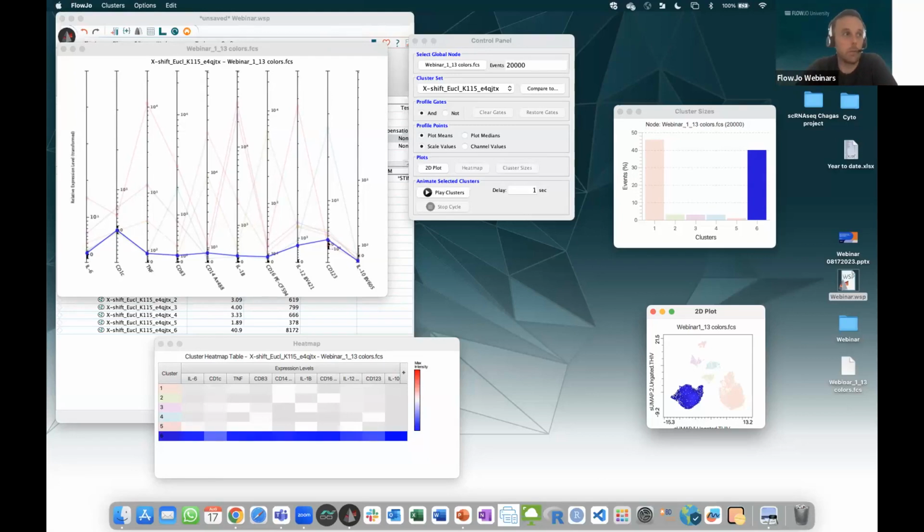If, for example, you're just interested in a T cell population, that's your question, you're probably going to use T-SNE because it's going to show you more different islands, maybe the different populations, so you can try to characterize different cell types. UMAP is more like the distance between each island has some kind of meaning.